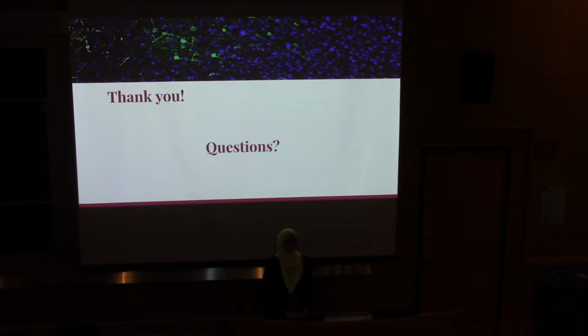Yeah, I don't think it's too much of a concern, because eventually what happens is that we perfuse the brain, so clearly the damage is resolved. But it's helpful to show us where the cannula was placed, just for the experiment, to understand where the placement of everything was and if it was in accurate locations.